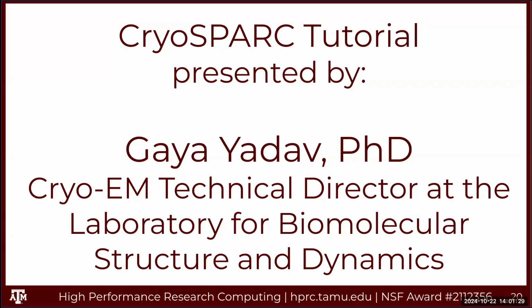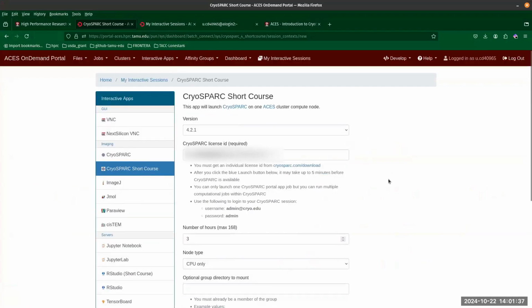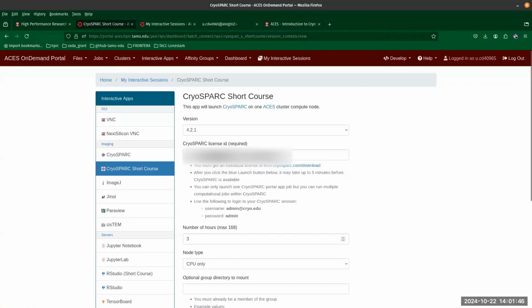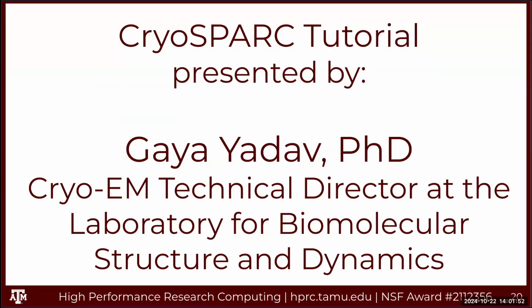You cannot share license ID. The license ID is for an individual user. If someone takes my license ID, then I can't launch CryoSPARC because they've got a session open. So I have to put that field in there. In the future, I'm going to see if I can make this a password field. But you have to use your own license ID.